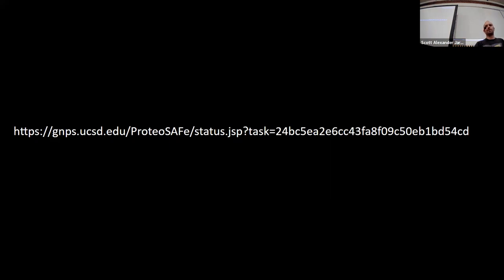I hope that by now you have gotten an email from the GNPS server saying that your job was done, and then there should be a long link in there, which you can click on, and then we can open that job. If this is not the case, I would recommend we do the coffee break now, and hopefully after the coffee break, look at this job.